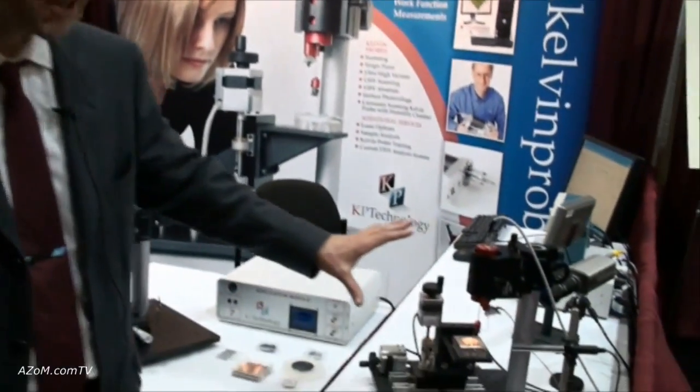This is Cameron Chai from azom.com and I'm speaking to Professor Ian Bakie from Kelvin Probe Specialists. He's going to explain and demonstrate the scanning Kelvin probe. Thank you. Here, this is a scanning Kelvin probe system.